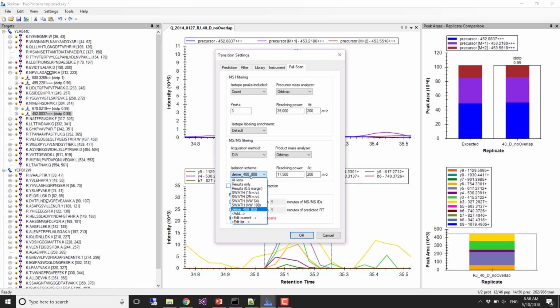You're always playing with higher resolution, which increases your scan time. He actually has graphs showing that if you don't use high enough resolution, there's an issue, because the Orbitrap takes a certain amount of time to do a scan, and so there's fill time. You want to have the optimal fill time for your scan time. All that stuff has been worked out, and there are presentations explaining that online.